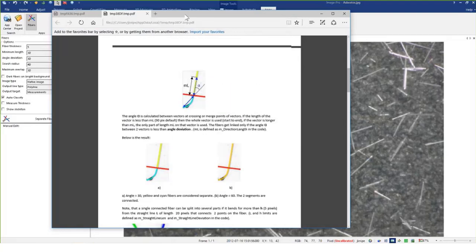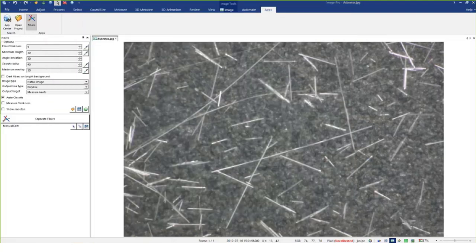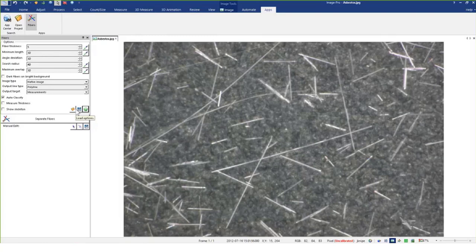Right now I'm using the default settings. As with many other things, I can always save the settings and recall them later if I want to use this app over and over again for a specific fiber type. Walking through the parameters — fiber thickness in pixels — what's nice is you have a little tool to actually draw on the fibers. I'm just going to use the default settings first so you can see what it is and see some of the changes you can make.